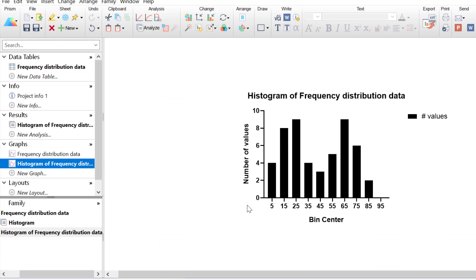In conclusion, you've learned how to generate a frequency distribution of your data. By running a frequency distribution you can check for outliers, skewness, find the mode value, and look for bimodality. I always recommend starting with frequency distributions when you first get a dataset to get a feel for what the data looks like.